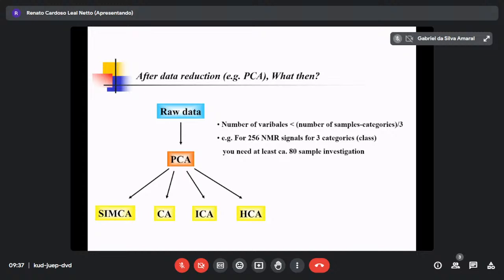When you do this, sometimes even for animal samples, I add one sample. I don't have to measure all the samples. Technical triplicate, biological triplicate, fine. But for technical, I measure one time. Say there are 10 kinds of samples. I don't have to measure technical replicates for each sample, but one time I choose one, for example, number 7, as a triplicate. Ideally, 7-1, 7-2, 7-3 should be on the same spot because they are technical replicates. If they are spread out, then your method has a problem or your machine has some problem. I think that is your question, right? Yes, sir.